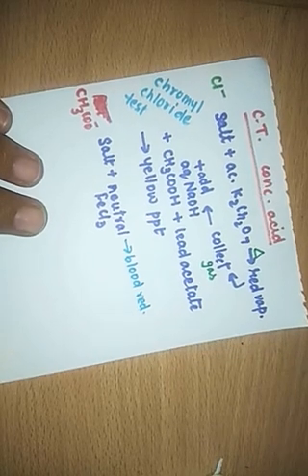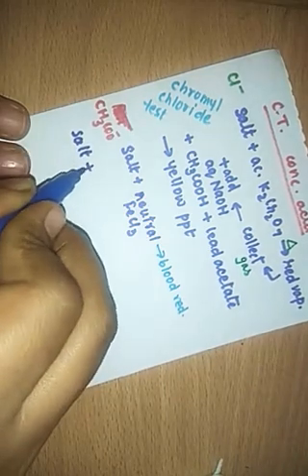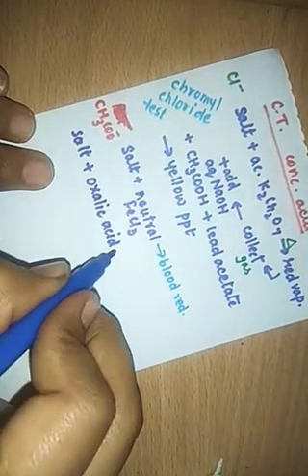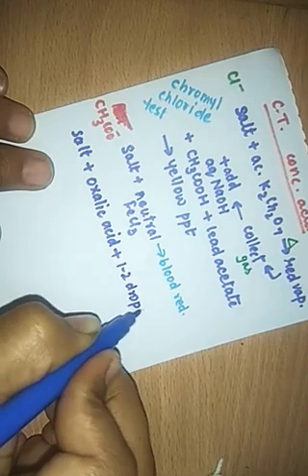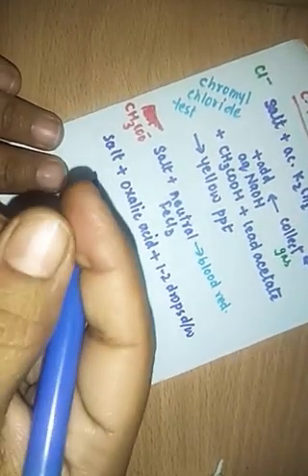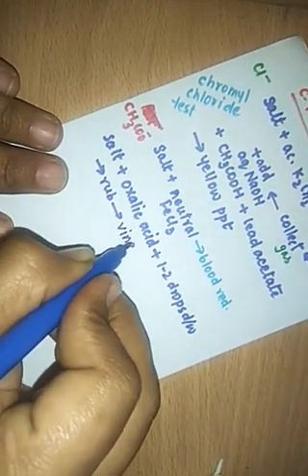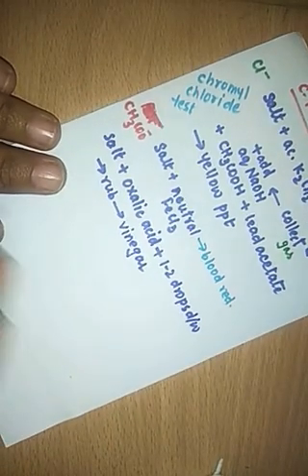One more test you can do is you can take the salt on a watch glass and then add oxalic acid, which is solid in the lab, then add 1-2 drops of distilled water, and just make a thick paste of it. After that, take the paste on your finger and just rub it. If you are rubbing it, and after that you smell it, you will get a strong smell of vinegar, which also confirms the presence of acetate ion, right?